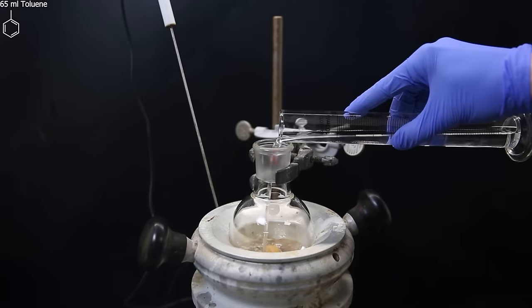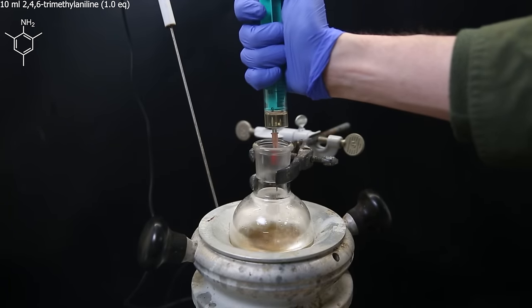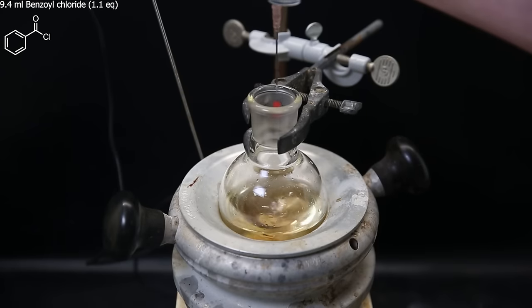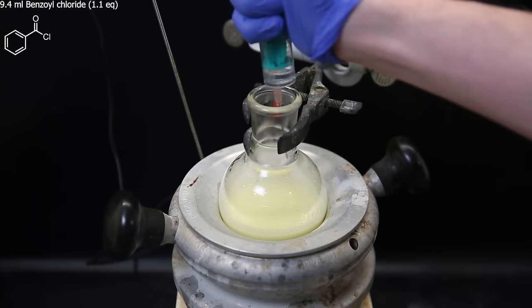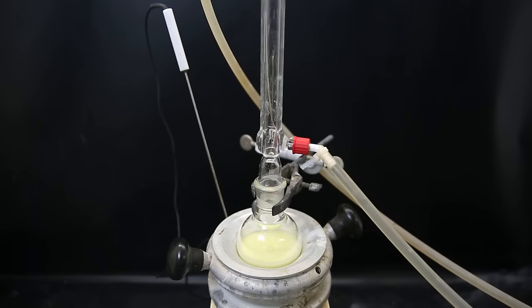I add in 65 mL of toluene as a solvent, and then 10 mL of 2,4,6-trimethylaniline. Then, at room temperature, I gradually add in 9.4 mL of benzoyl chloride. It almost immediately changes colors, and a precipitate forms. I then attach a condenser and start refluxing the mixture for 16 hours.